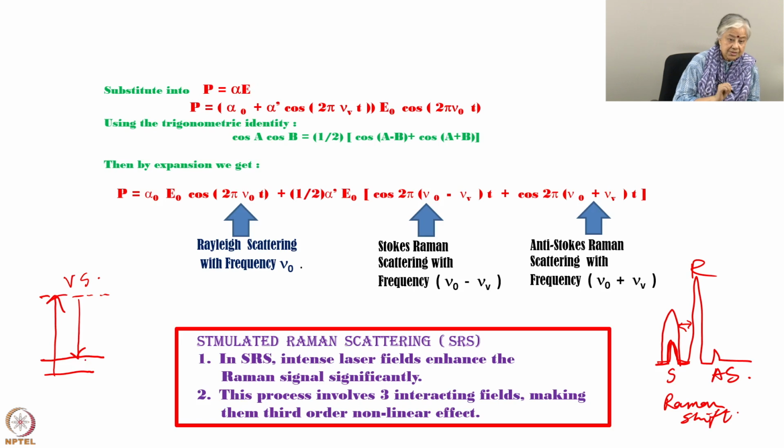So, here I have this is the spontaneous. Now, how do I make it stimulated? See, I have only input this wavelength or this frequency, this has come down on its own. There is a nu m which was on its own, it has come down. Now, what people have done is, they have taken this wavelength, they have used a laser for this wavelength, and for this wavelength also they have taken another laser which they can keep on tuning.